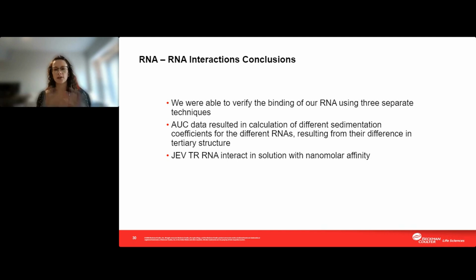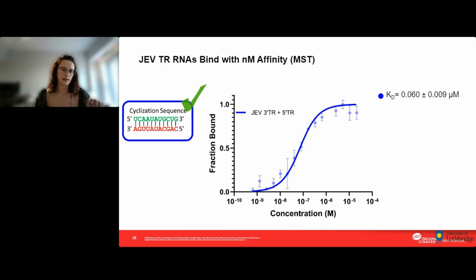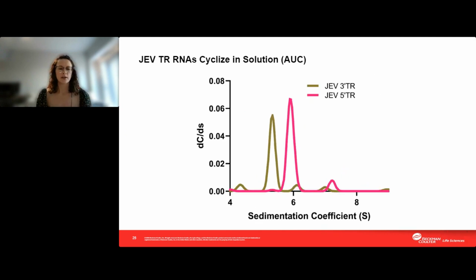As you guys saw, I'll just go back to here. There are some additional peaks shown here besides just the main one, corresponding to most likely the dimer and potentially a small degradant of the RNA. However, this isn't always the case in the RNAs we've measured. If they tend to have lots of different folding states, you will see multiple peaks appearing. So we troubleshot this a little bit to try and figure out if the RNA was aggregating or degrading or what it was.